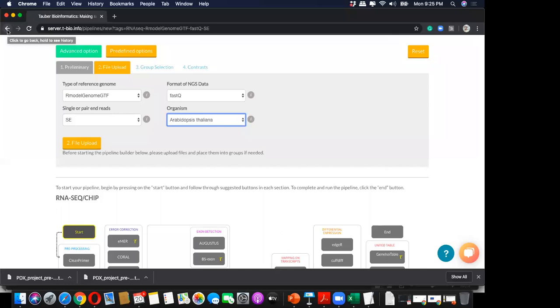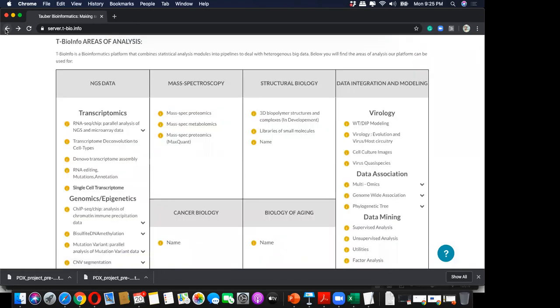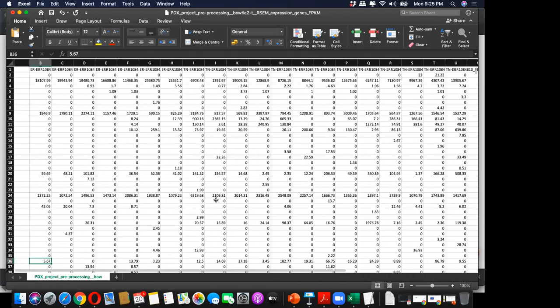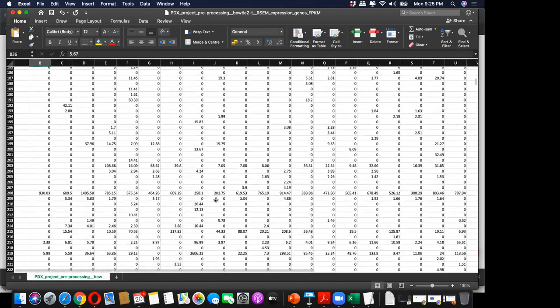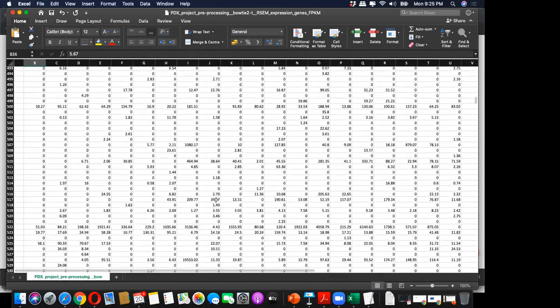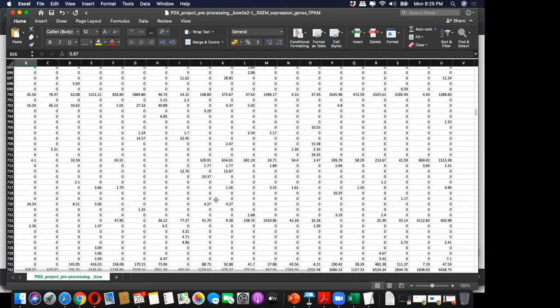And I think this part, which we did today, is equally exciting, because from sequences, raw reads, raw data, we are coming to a table of expression where, if you start plotting this, we will understand the differences in gene expression of some of the genes which are there in some samples, and some of the genes which are there in the other samples.